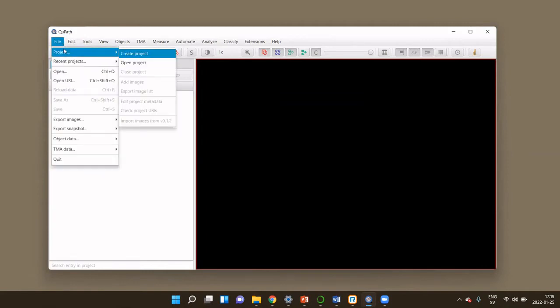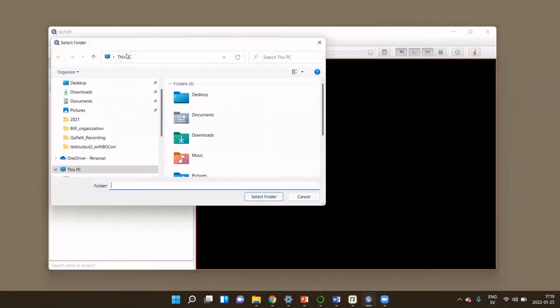I have QuPath already open and I've done nothing else. The first thing you need to do when you start a new image analysis project is to really create a project. We do this under File > Project > Create Project.